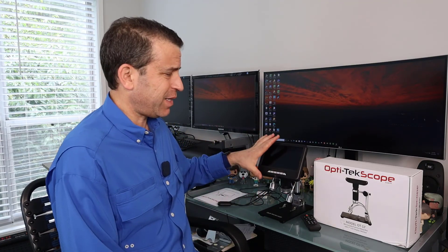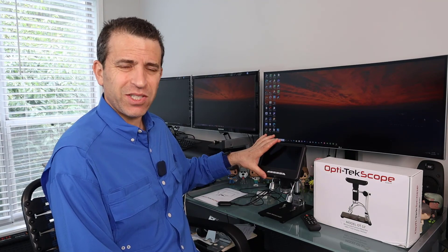Hey everybody, hope you're having a great day. Welcome to Sid's Tips and today we are going to talk about this digital microscope by OptiTech. I did another review about four years ago with one of their other microscopes and this one is really nice. You've got this seven inch LCD screen and it's got up to a hundred times magnification. Really, really awesome.